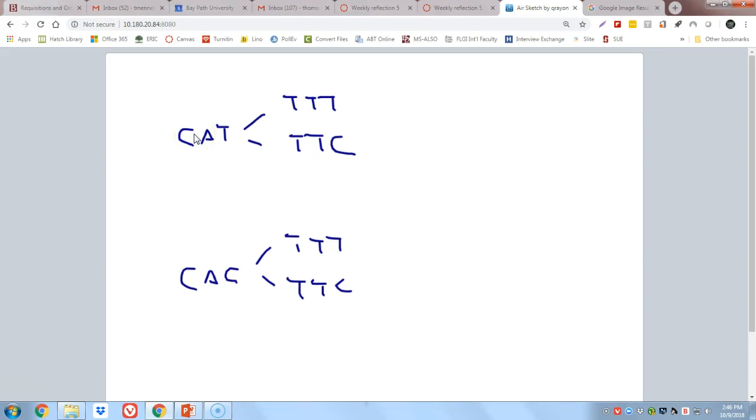We don't know which codon encodes that first histidine, and we don't know which codon encodes that second phenylalanine. So we're making a pool of primers that has every possible combination of codon to give us a histidine followed by a phenylalanine. One of those 4 primers that I just listed a moment ago is the right primer. There's no other way to get a histidine followed by a phenylalanine. We just don't know which one of the 4 it is.